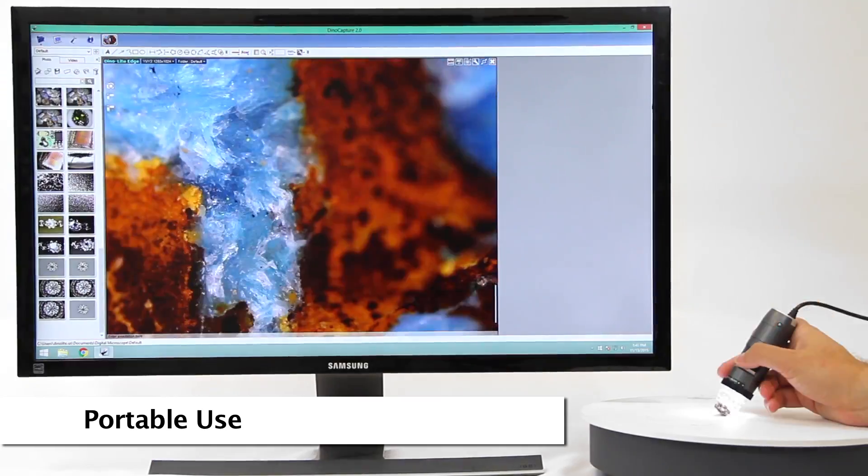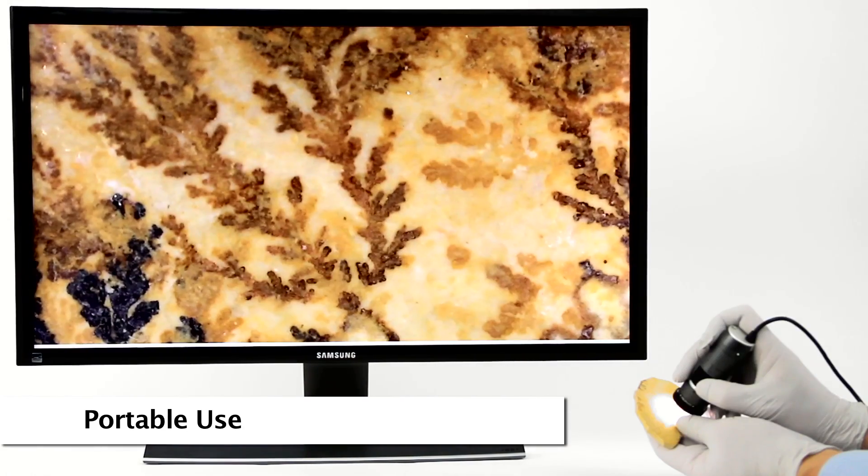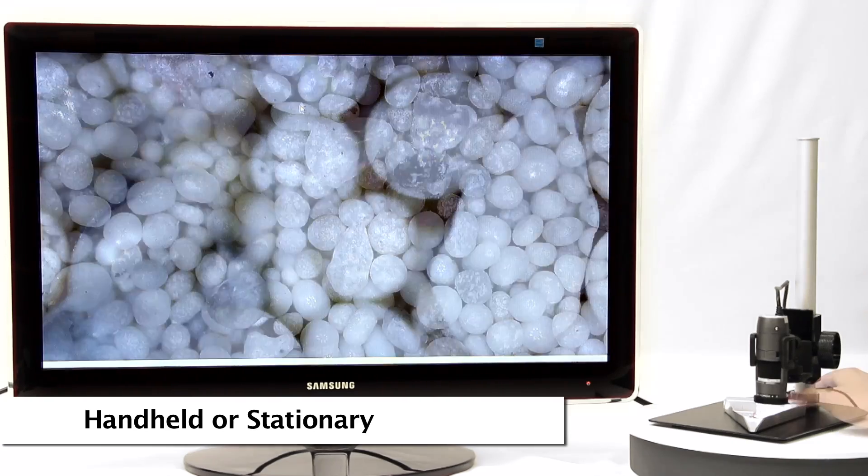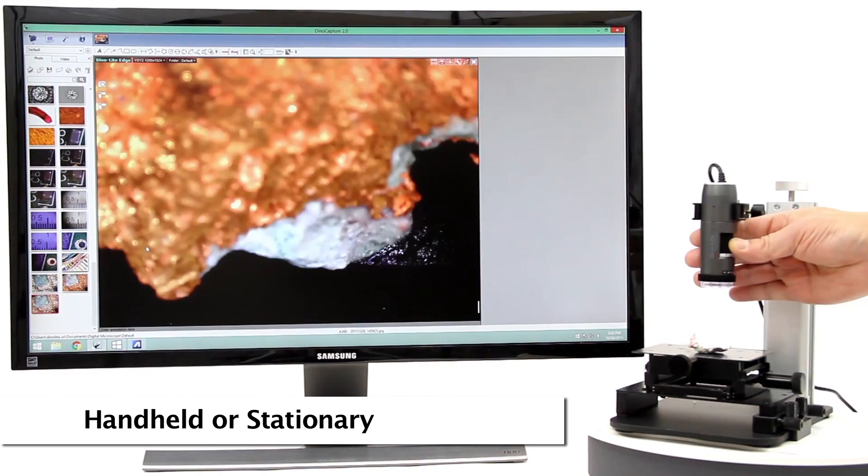The Dynolite is a handheld microscope camera with most standard models going up to 220 times magnification. These models are connected to a computer via USB and include an easy to use software that allows users to capture images and video as well as many other basic and advanced features.